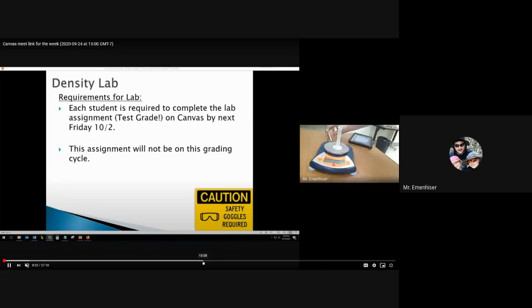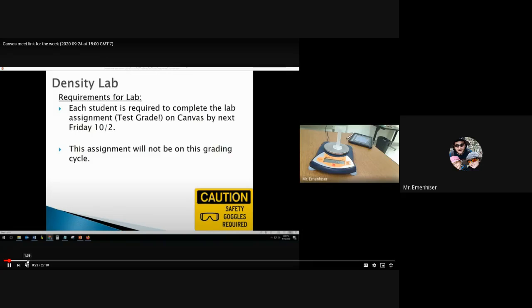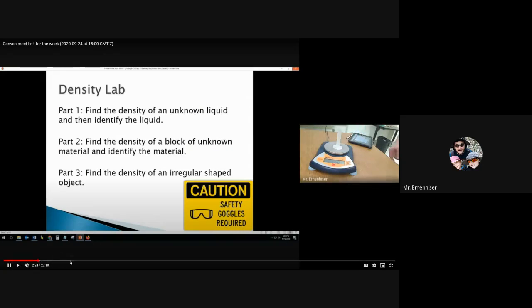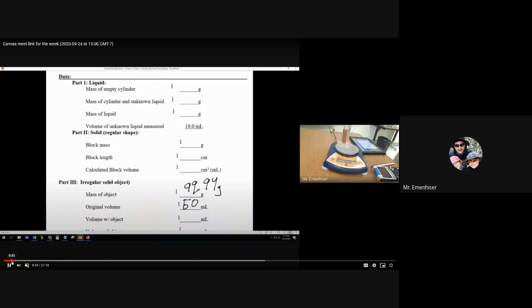So you can see me in this video. I'm kind of moving some stuff right now. And I'm just talking about the density lab. As you can see on the camera there, I've got the scale there, and it's set at 0. Is this the right one? Yeah, this is the right video, because I go all the way through it. Yeah, okay.